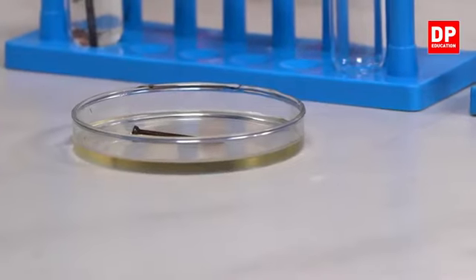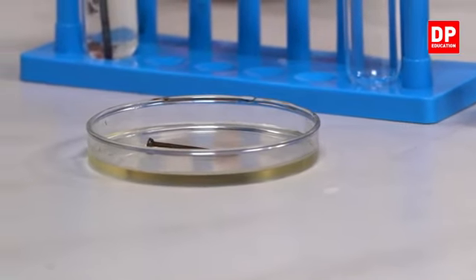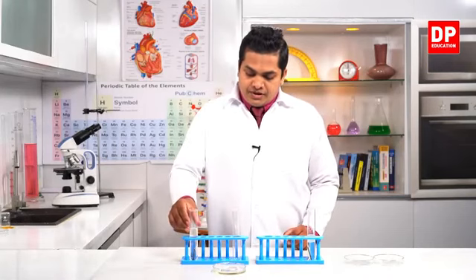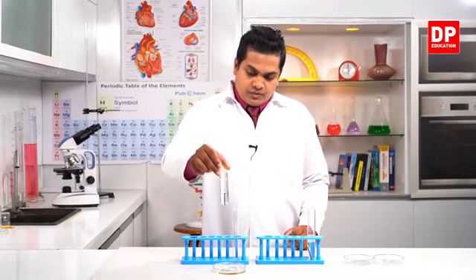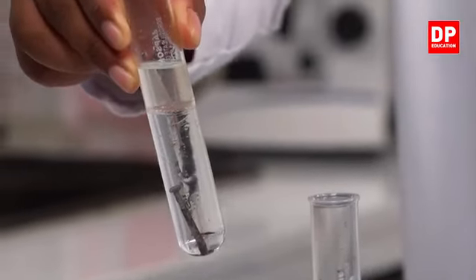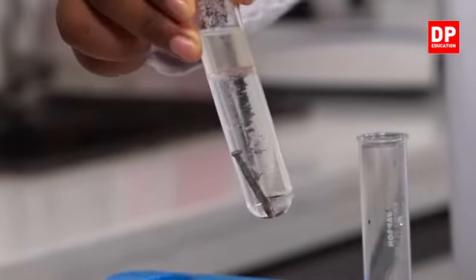This is the first one which contains normal water. Okay. Now I'm going to use the boiling tube which contains normal water plus some amount of coconut oil.